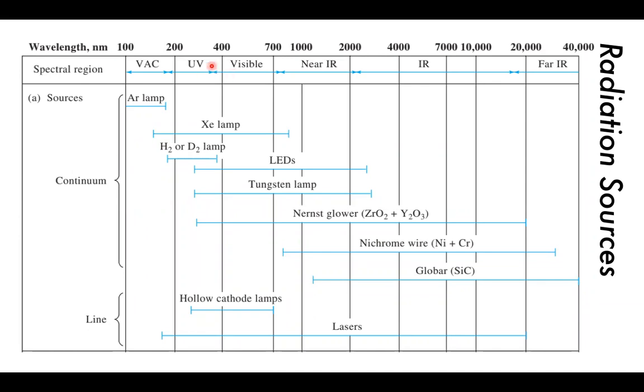Typically UV-vis is very, very useful in quantifying the amount of something that is present. And so that's something that we'll probably come across a lot if we work in or around a company which is either making a product or selling a product which has some sort of chemical component in it.